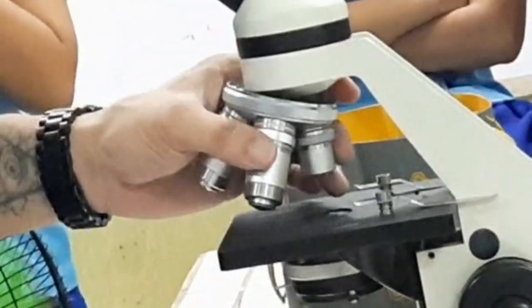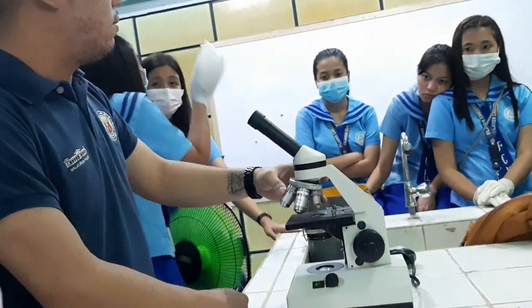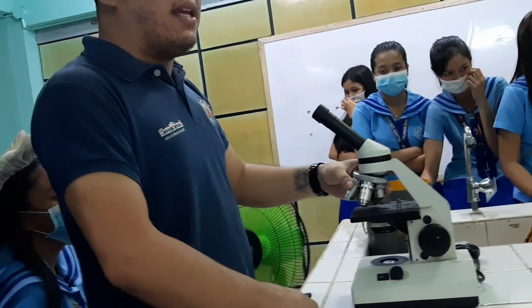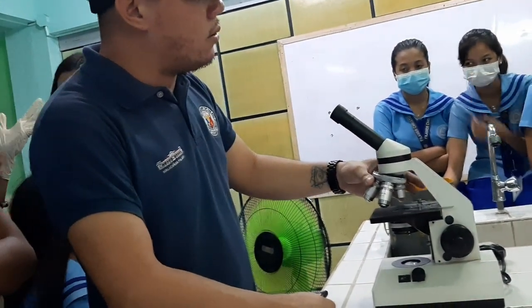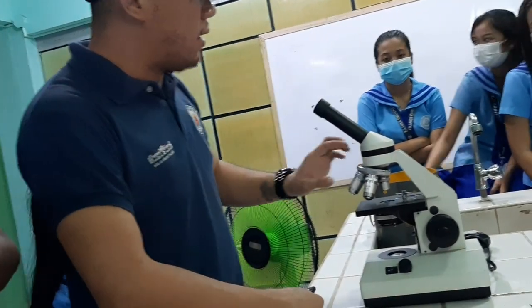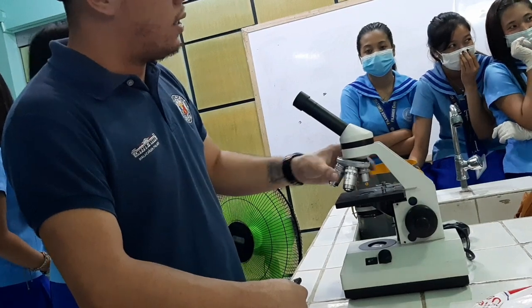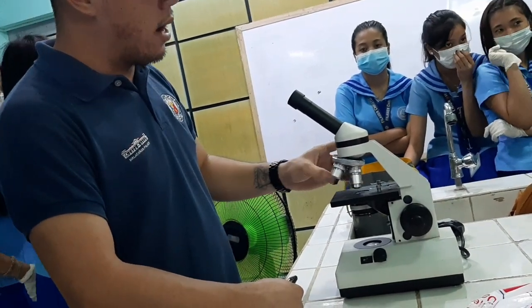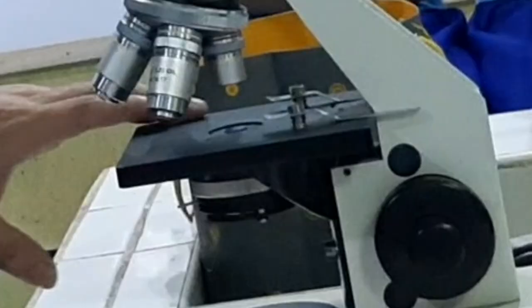This is the objective. So it means that when you say objectives, amuni siya ang nag-control sang zoom. Okay? So, mayari diri ang lower power din niya, yeah? Okay? So, times 4, times 10, times 40, and times 100. So, pwede na siya malibot. Oh, this is times 4. So, times 10. Times 40. Times 100. This is the stage.